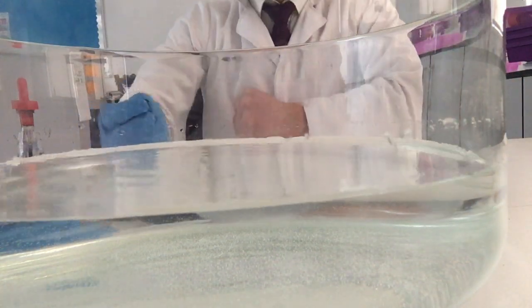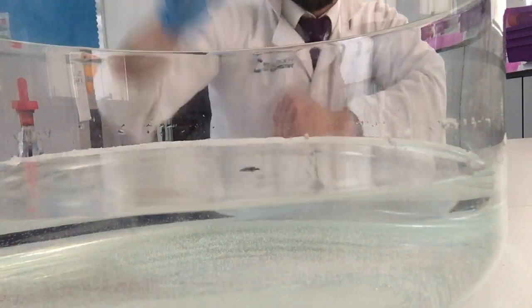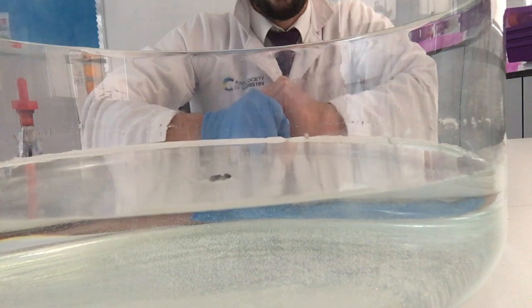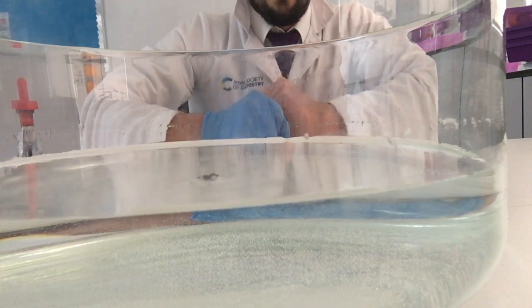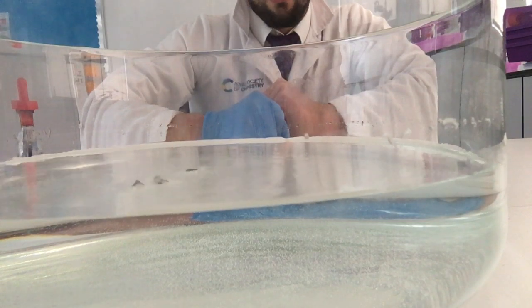That was sodium. I'm going to try now some lithium, which is another alkali metal. We're going to see what happens this time. So lithium is in period 2. Let's see it react with water. Oh, it's taken a while to get going. But there you go. I hope you can see it starting to react quite strongly with the water now.